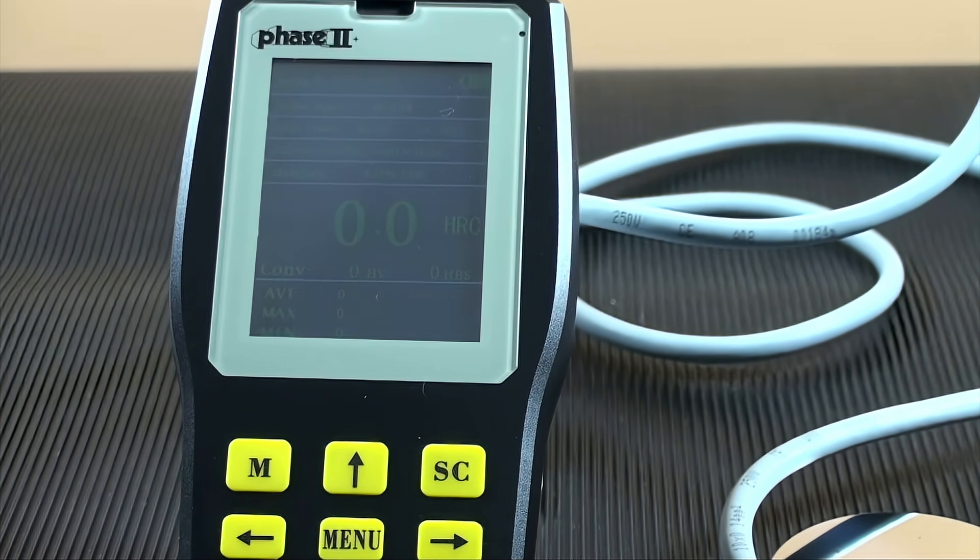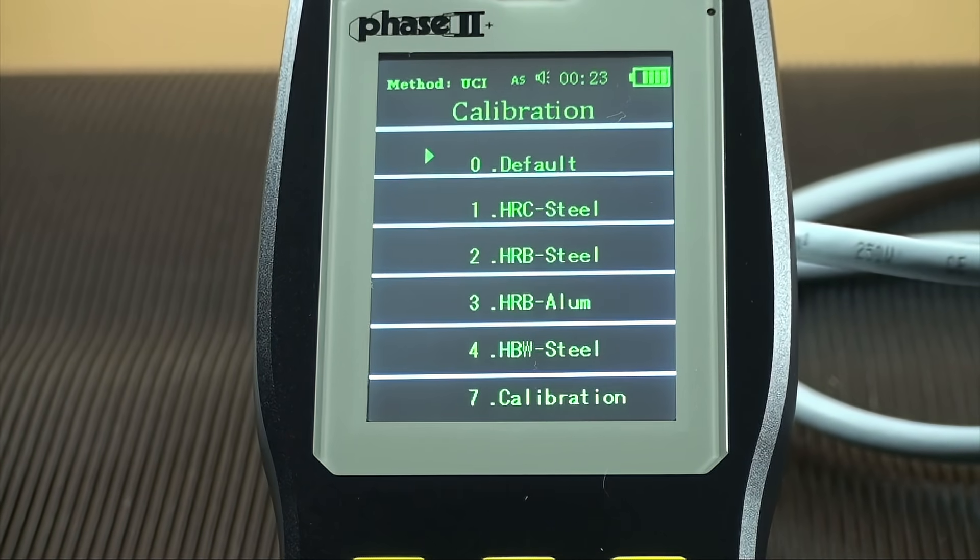The interface will power off after a short time without using the tester. Each tester is provided with four standard calibrations for different materials: steel to read in HRC, steel to read in Brinell, steel to read in HRB, aluminum to read in HRB. If desired, any other material scale combinations can be added with a known standard for calibration on the fly. They can also be individually named.